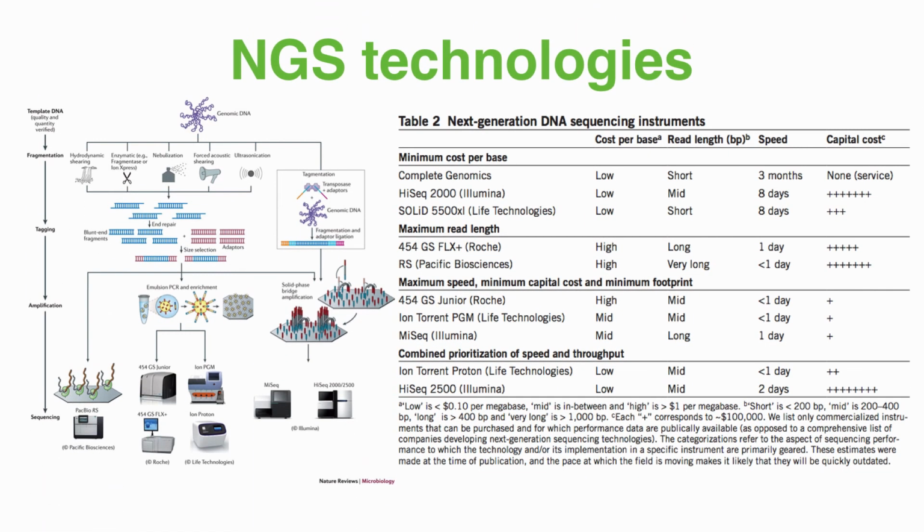So, in review, we looked at the recent strides of sequencing technology from the first generation Sanger to the next generation technologies started with pyrosequencing, represented by 454, Ion Torrent, and Illumina sequencing, which are the most common technologies today. In addition, we looked at two of the third generation single molecule sequencing technologies that will be more and more common in the coming years.